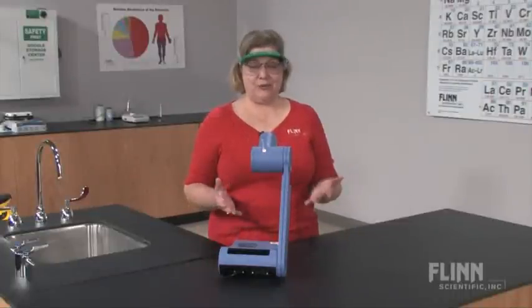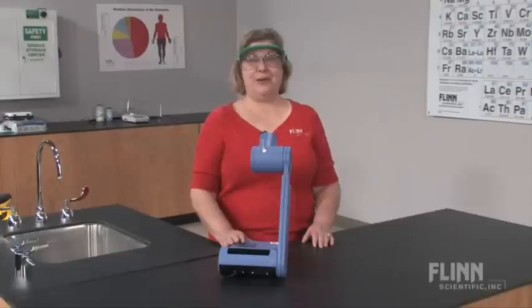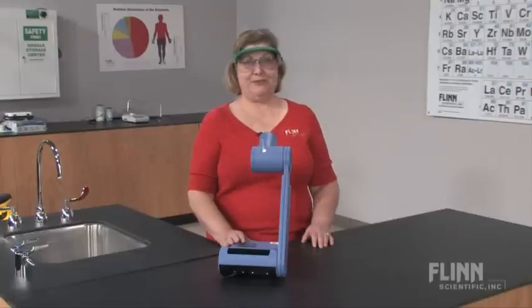Precisely, accurately, and quickly — with a research-grade melting point apparatus that's priced for education.